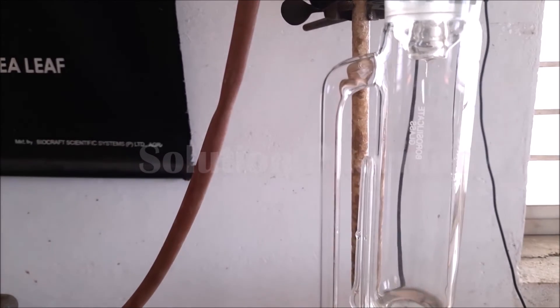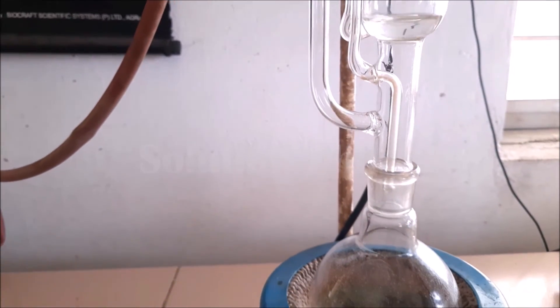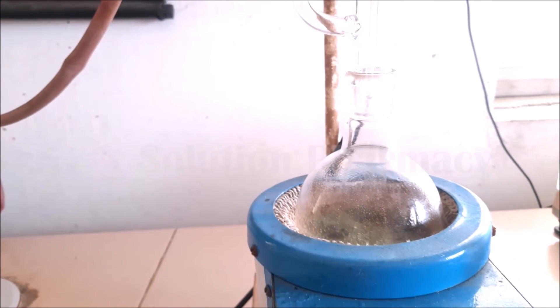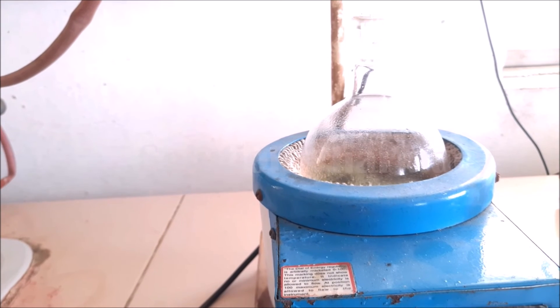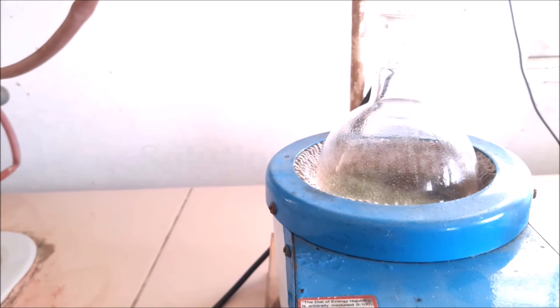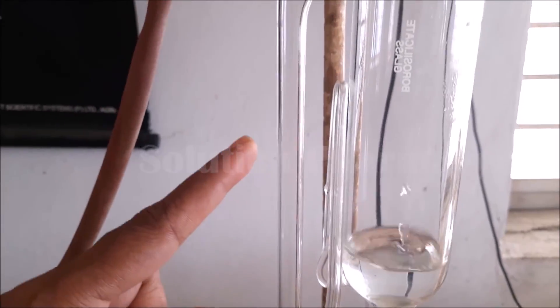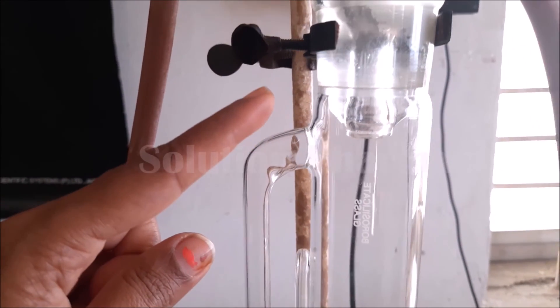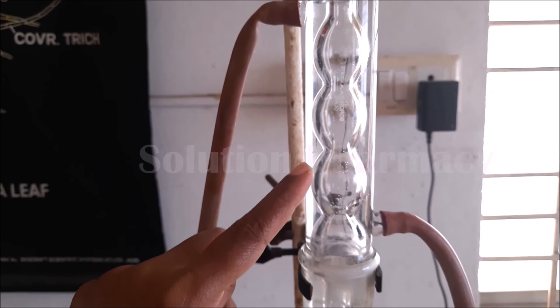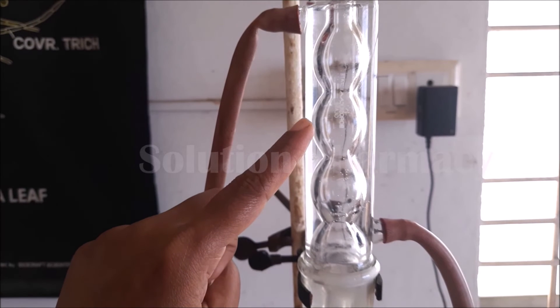The Soxhlet extractor is kept empty, and below it we attach the round bottom flask containing the liquid extract — the solvent we want to recover — so that we get a concentrated extract. The rest of the setup is the same as before. On boiling, the solvent evaporates and passes through the side tube to the condenser. The condenser consists of two tubes: inner and outer. In the outer tube, cold water comes in through the inlet and hot water exits through the outlet.